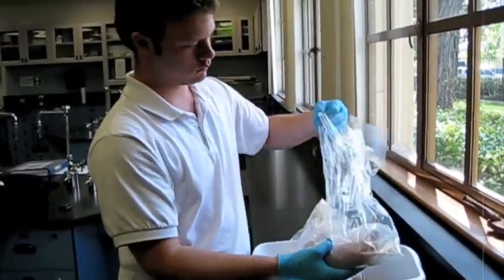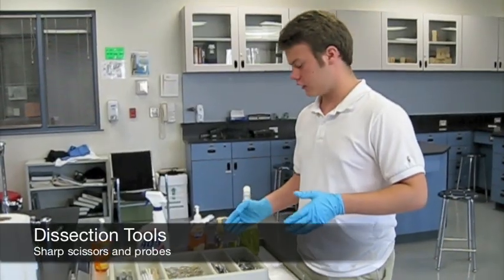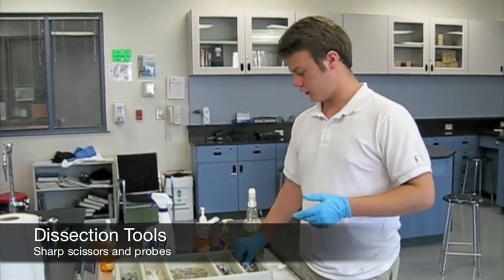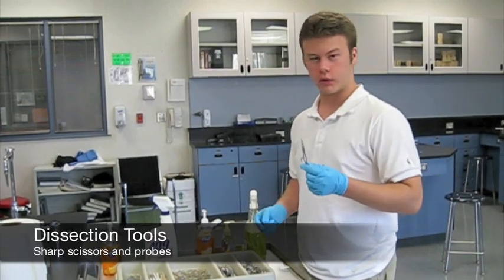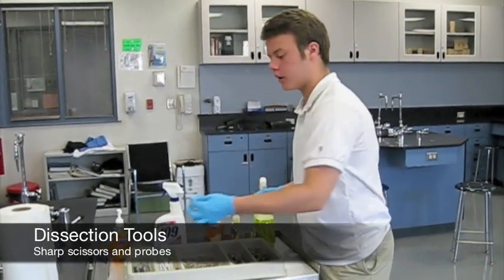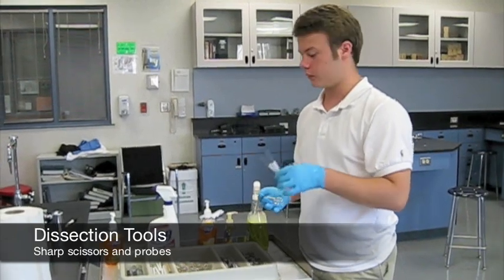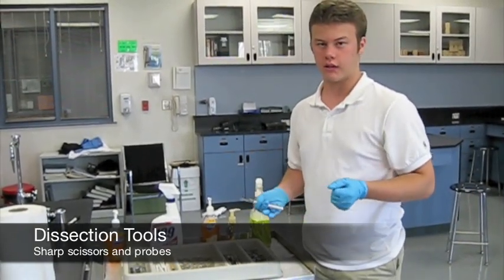Your teacher will distribute the pigs once you are prepared. For the dissection, you are going to need a couple of different tools. First and foremost, your cutting implement is going to be a pair of sharp point scissors. To hold back any of the tissue that you are going to need to be examining, you are probably going to want to get a couple of probes. Check with your teacher to see how many will be available that day for your dissection.